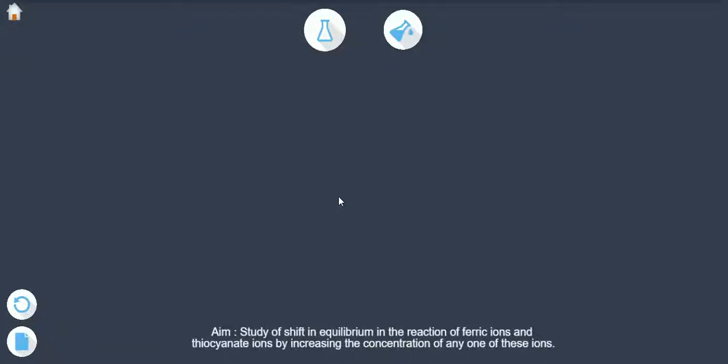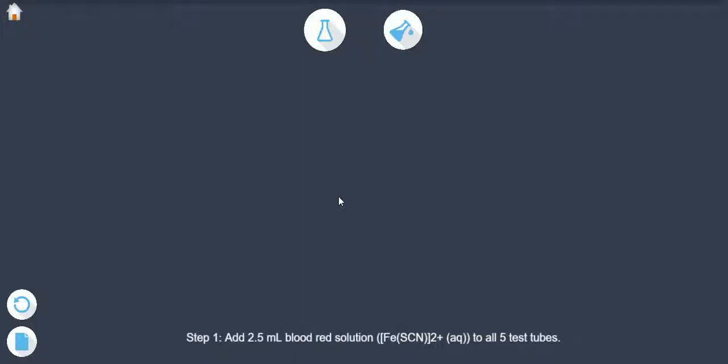AIM: Study of shift in equilibrium in the reaction of ferric ions and thiocyanate ions by increasing the concentration of any one of these ions. Add 2.5 ml blood red solution, i.e. ferric thiocyanate aqueous, to all 5 test tubes.